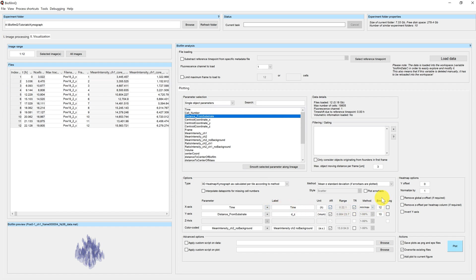Now before plotting we should make sure that our bin size is chosen properly. The bin size should always be larger than the cube size. So in our case we have cubes of maybe one micron in height.